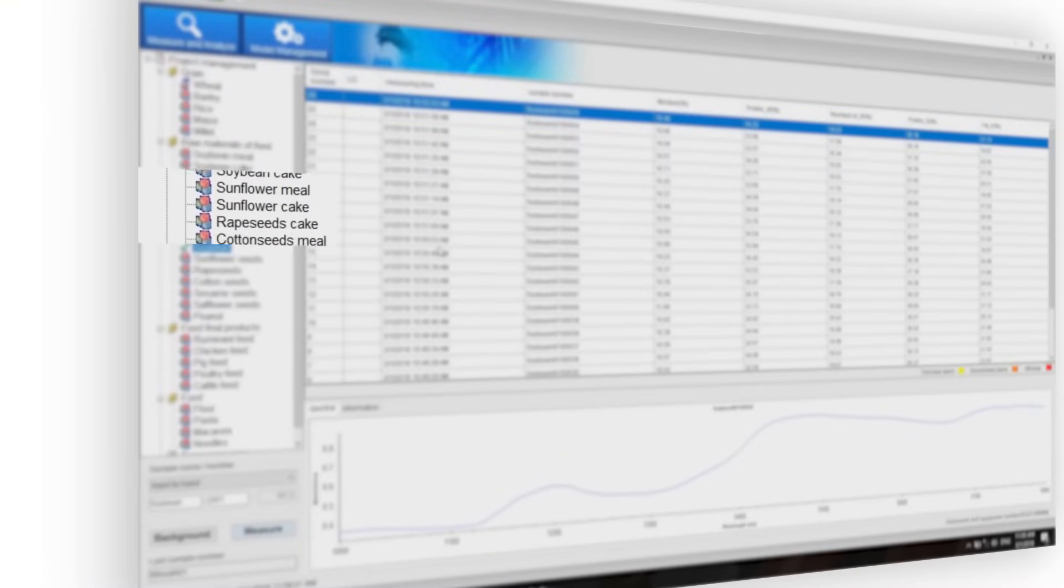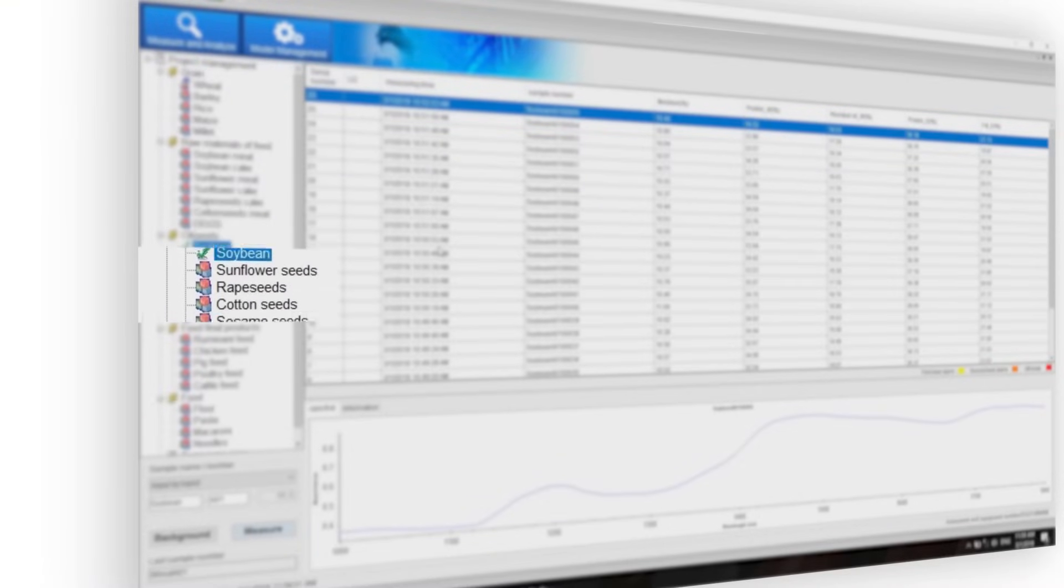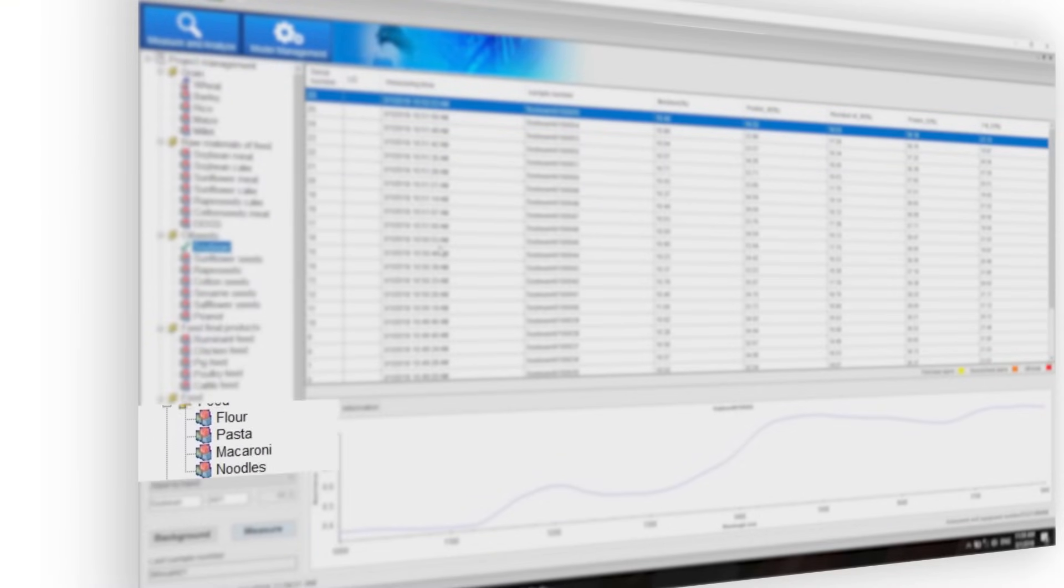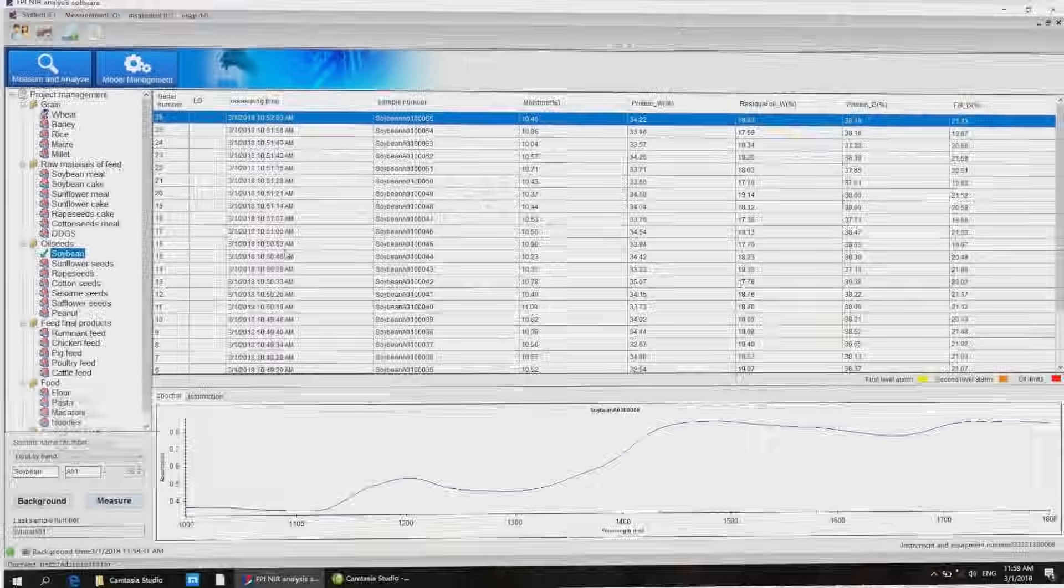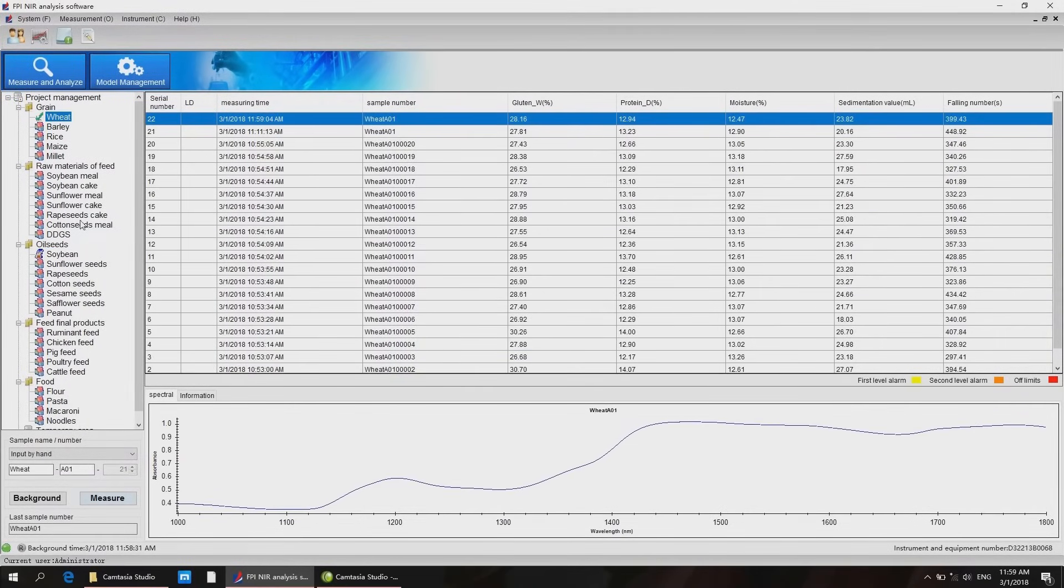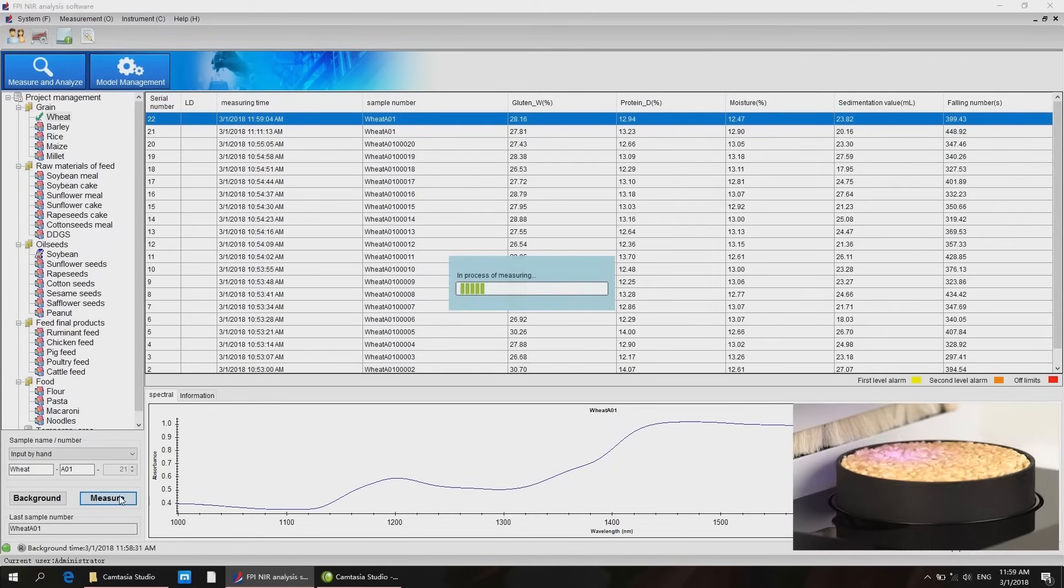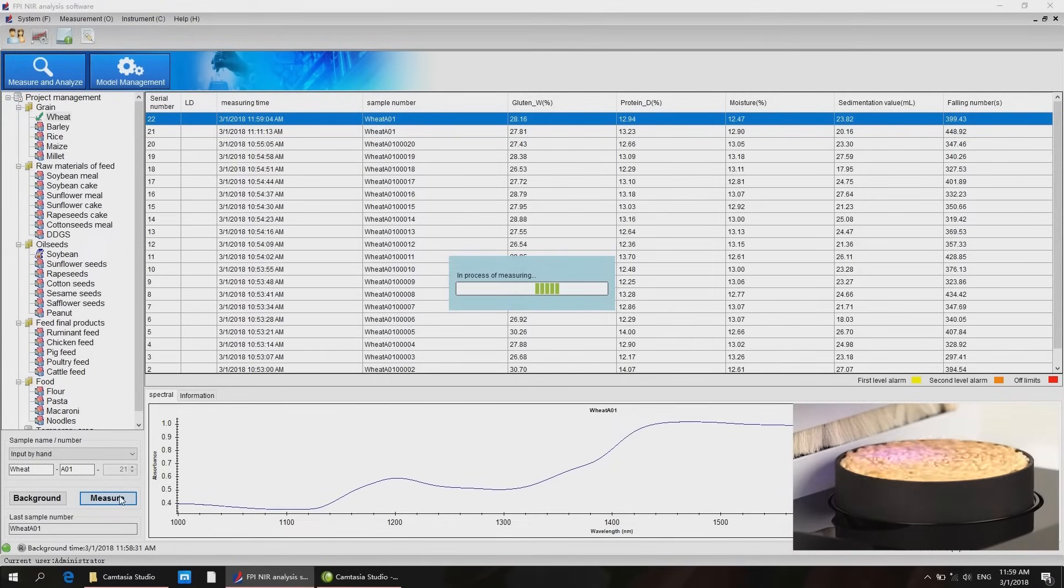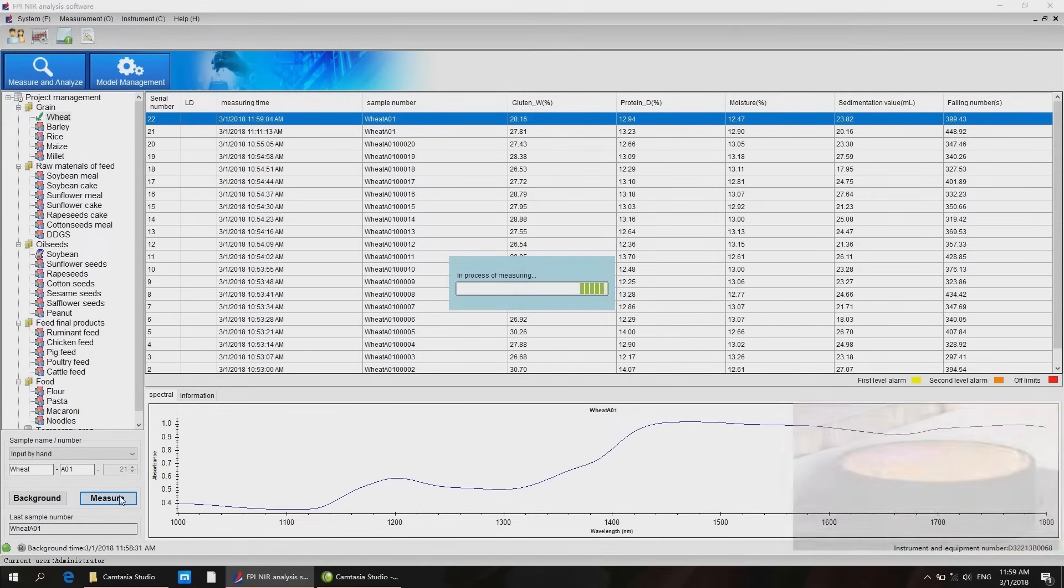The operation of the device is particularly simple. Choose the product to be analyzed from the database, place the sample on the sample plate, first measure, and you can get the results in less than 10 seconds.